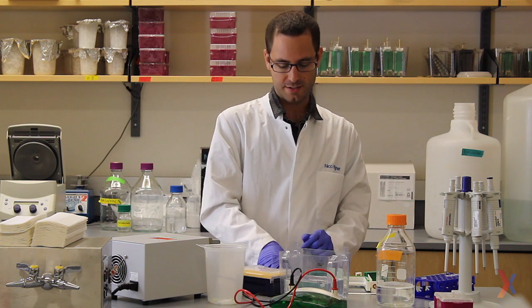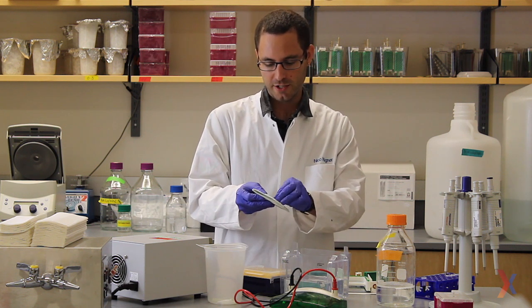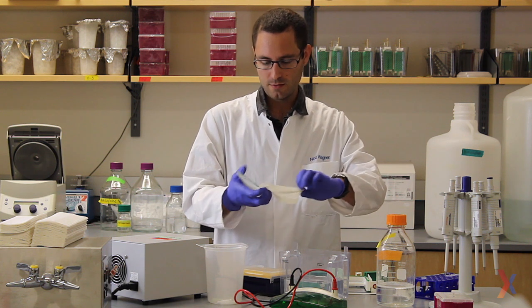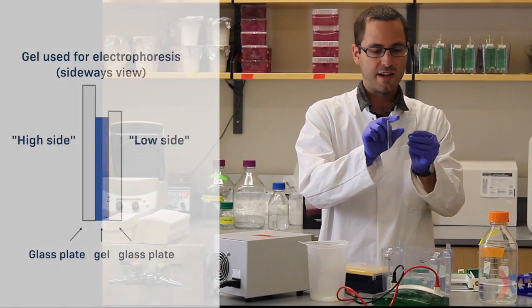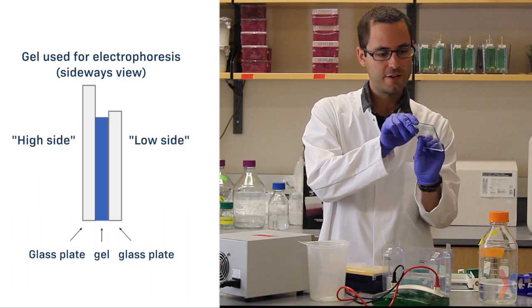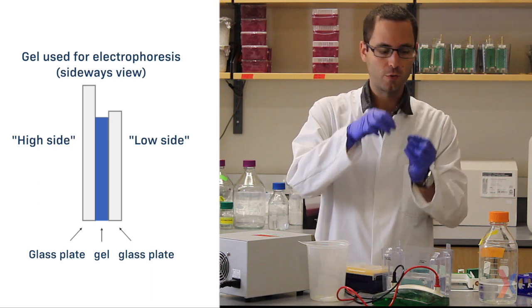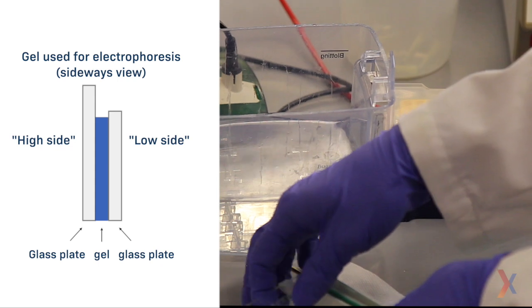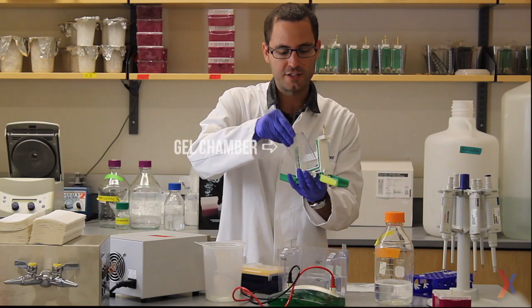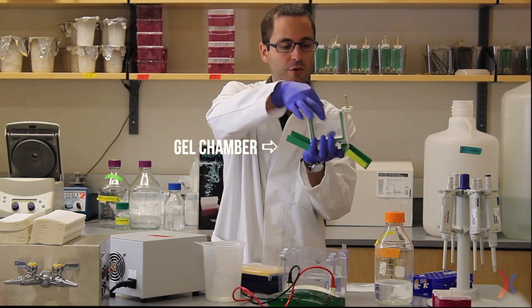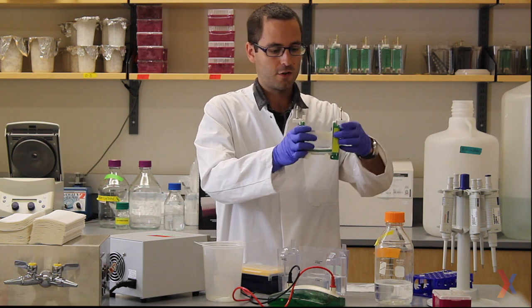Before the samples can be loaded in the gel, the gel needs to be set up. We have a brand new gel right here, which I can take out. There's a high side to this glass and a low side to this glass, and it's important that the lower side goes towards the inside of the gel running chamber. This is the gel running chamber. I have placed the lower side towards the inside. Close it up and place it into here.